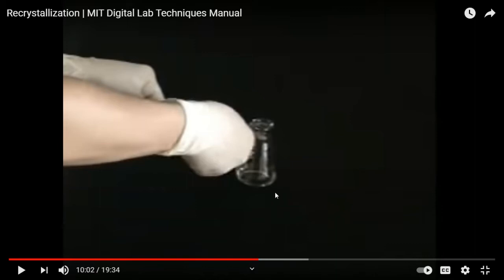Solid is not crystal. When I look at your outcome, I know whether you made a solid or you made a crystal. The group who made just a solid is the one that did not listen to me and put the product into the ice bath right away so they could form crystals quickly. Always remember, rushing is causing trouble. You have to take enough time. Okay, the details hopefully we can discuss at some point today. Let's see. So slowly they're cooling it for a very good scientific reason.